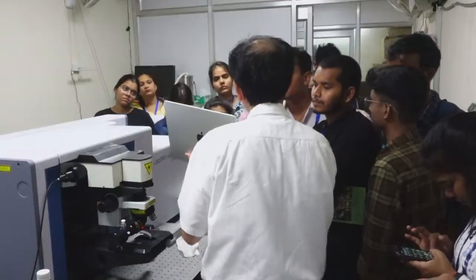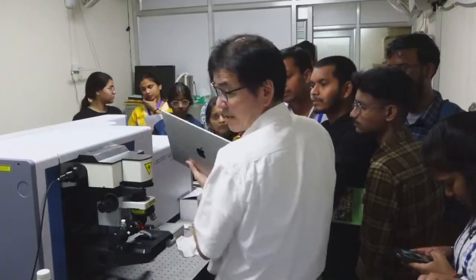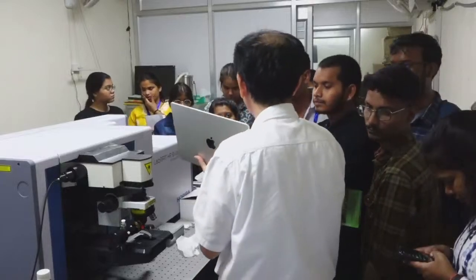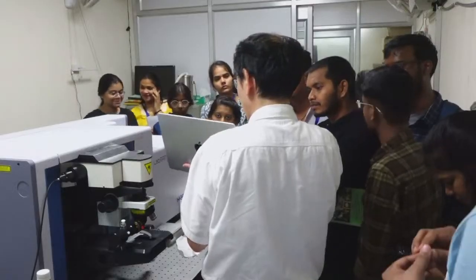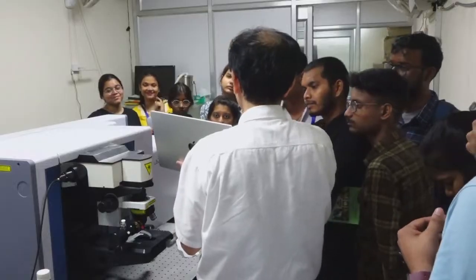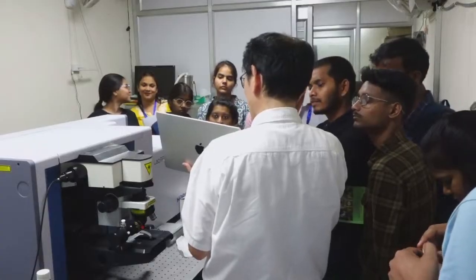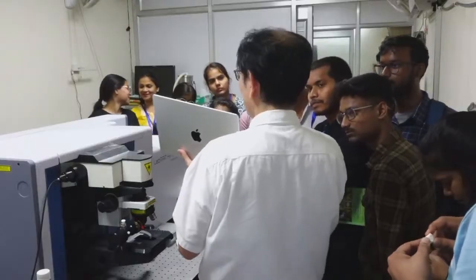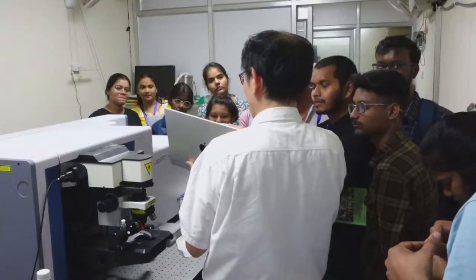This can also show the number of scans. Number of scans, how much time? 6-second exposure and 4 times accumulation, 24 seconds. Already this is good enough to distinguish. So it depends on the purpose. If we want to distinguish which is fructose and which is glucose, say I want to add fructose to my cooking, then it's easy to use a Raman spectrometer to identify which is fructose.